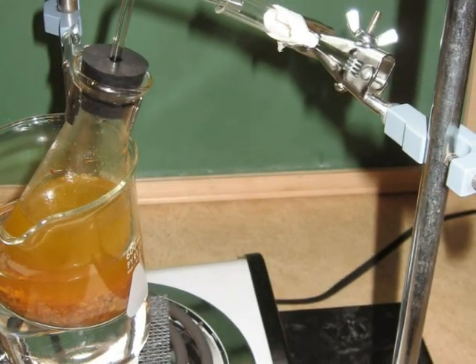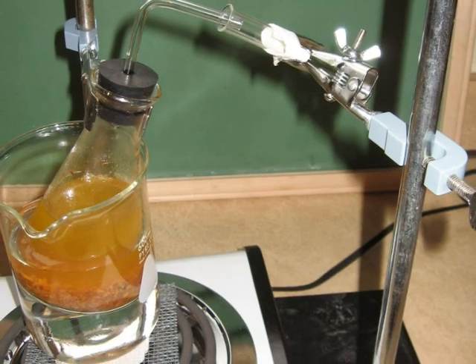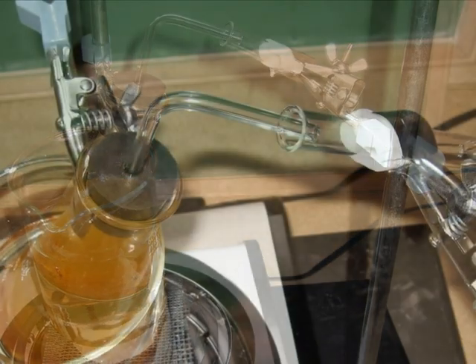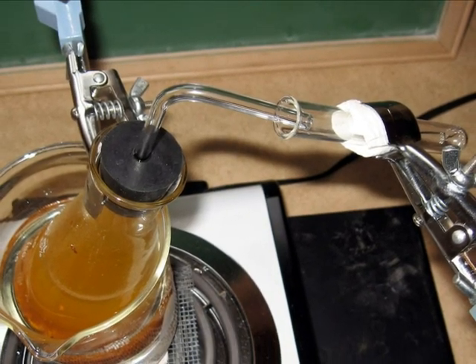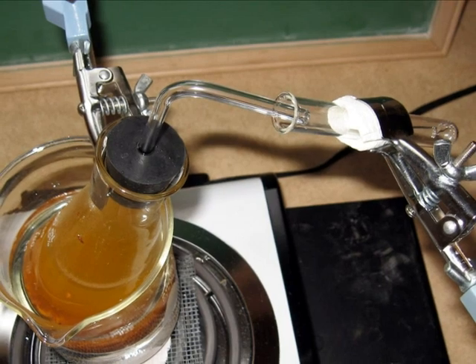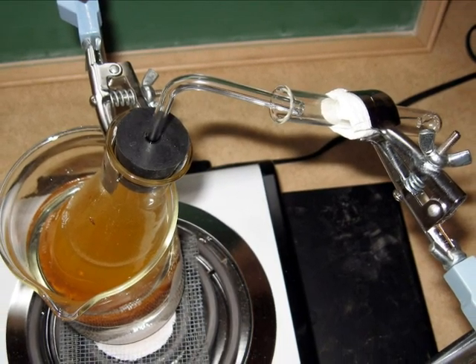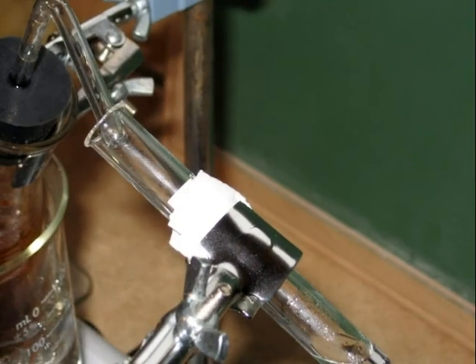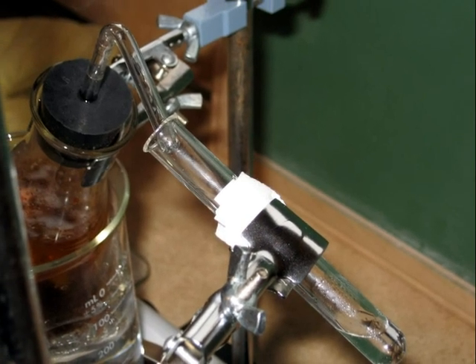Since alcohol has a lower boiling point than the vegetable oil, it will boil first, becoming a gas and leave the mixture. The gas and alcohol vapor will then enter the glass tubing, condense back into a liquid because of the cool air surrounding the glass tubing, and drip into the test tube. The alcohol will condense back into a liquid and settle at the bottom of the test tube.